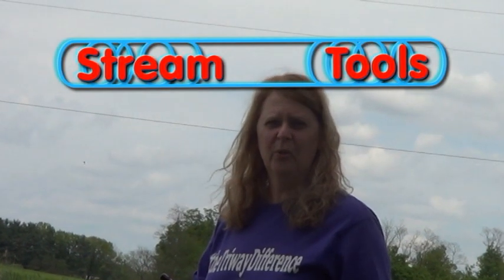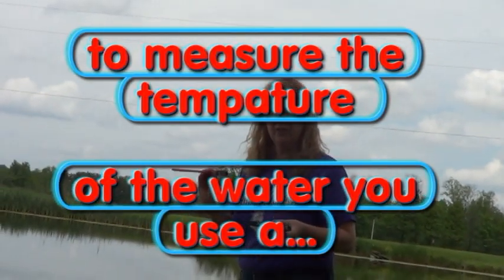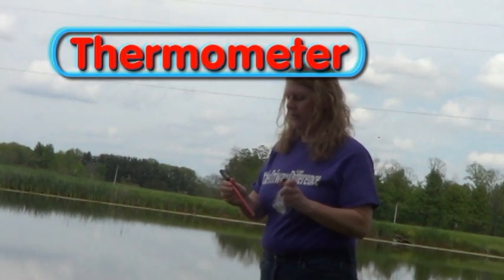Let's get to it. Hello, today we're going to learn about stream tools. We're going to start with how to measure the temperature of the water using thermometers. There's two different kinds of thermometers.